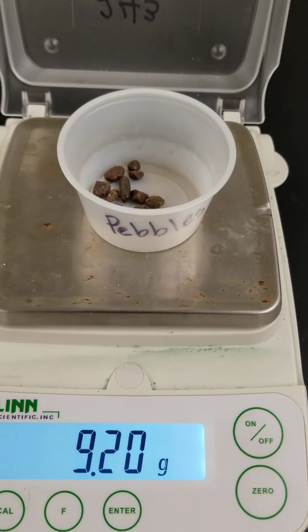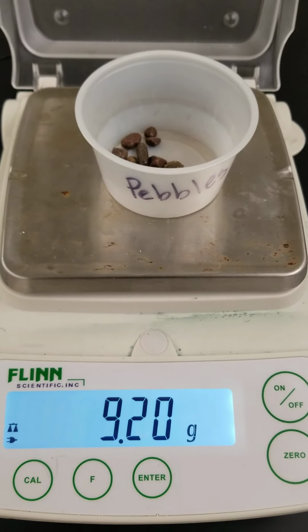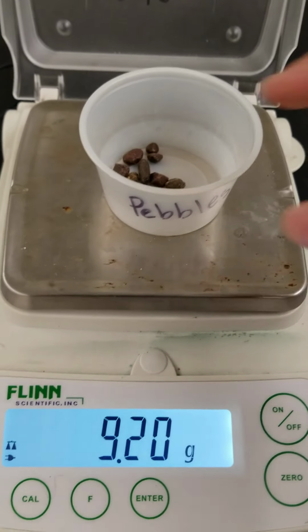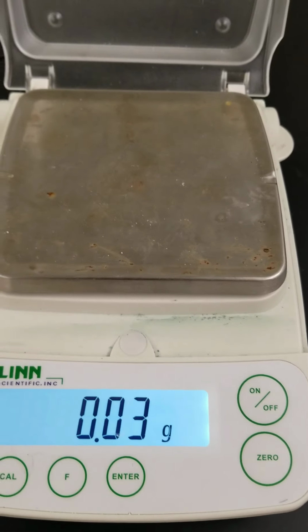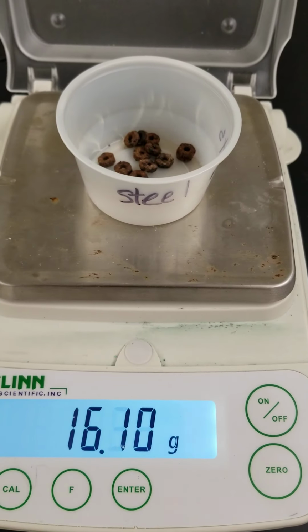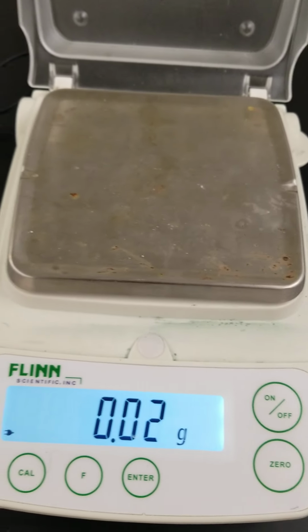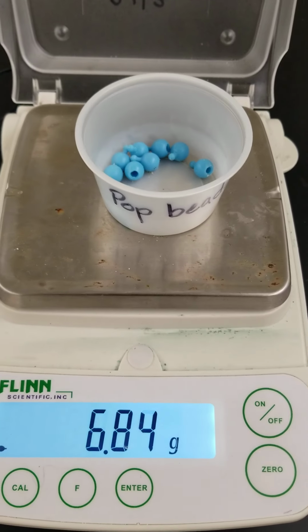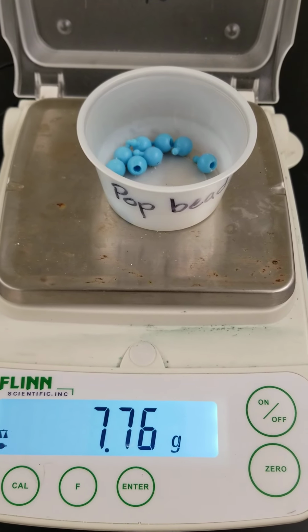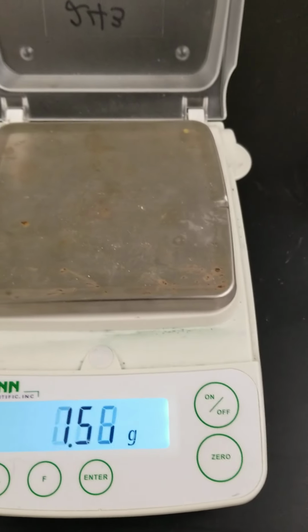Sorry, this is supposed to be the last one. These are the pebbles. So 9.20. So again, this should be the last one on the list, pebbles, 9.20. Let me put them back in order again. These are our steel nuts, 16.07. And then our pop beads, 7.76.